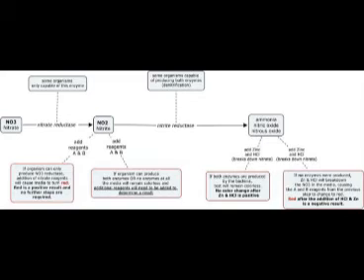This flow chart shows the different possible reactions depending on which or if both enzymes have been produced. So remember, some organisms may produce nitrate reductase only, others may produce nitrate and nitrite reductase, and yet other organisms will not produce either. And using the nitrate test, you can tell which enzyme is being produced.